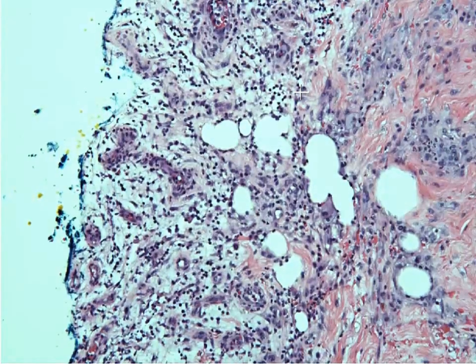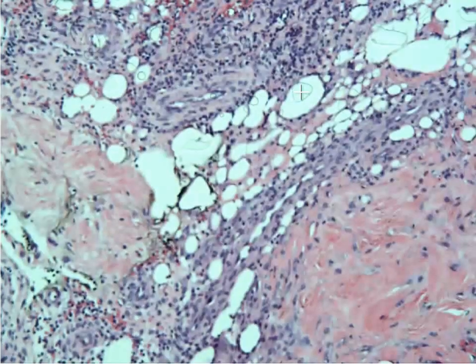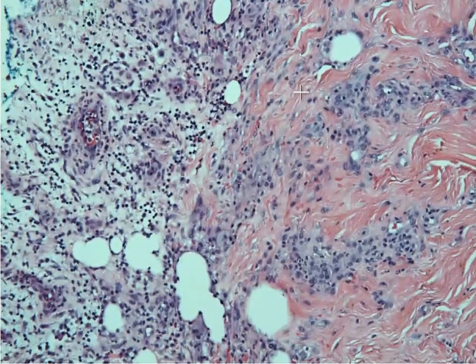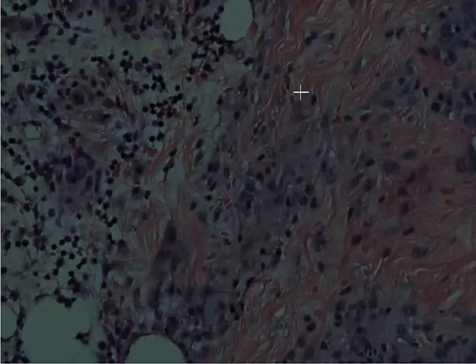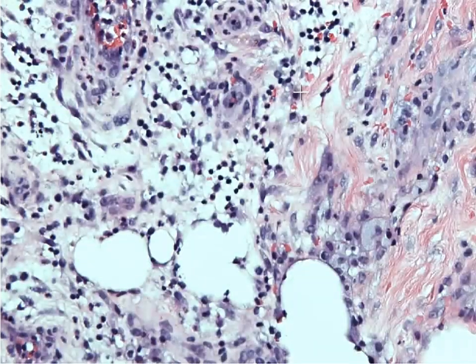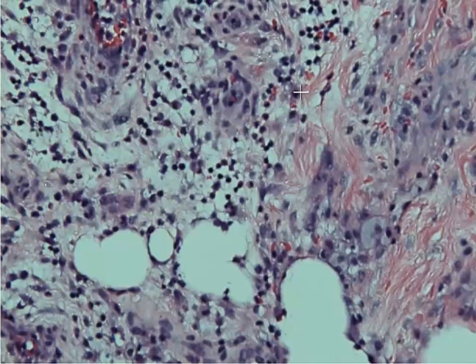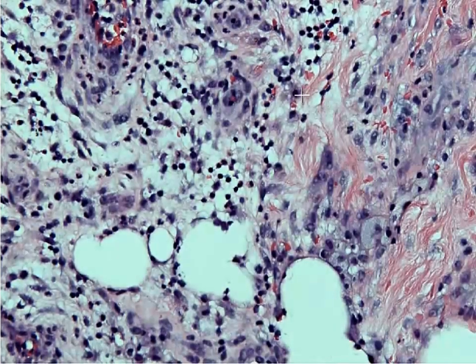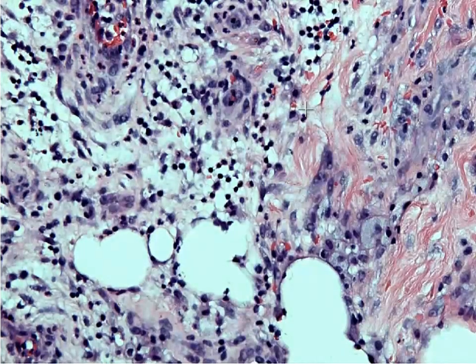This is a great example of a case where we can actually go down and identify a lot of these inflammatory cells. I'll spend a minute showing you what they look like under a microscope.